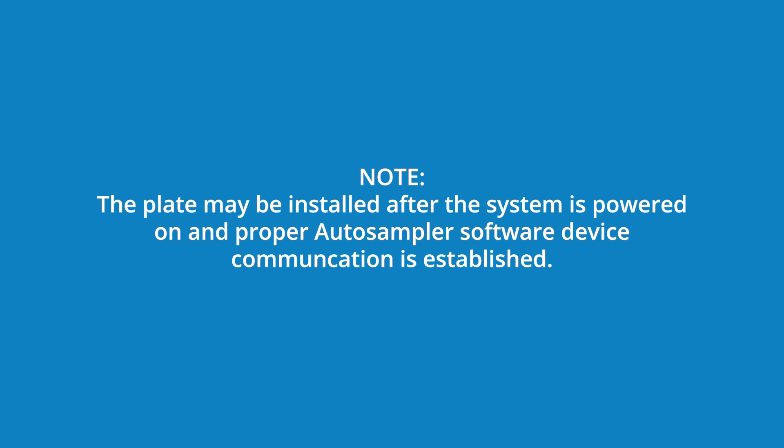Note that the plate may be installed after the system is powered on and proper auto sampler software device communication is established.